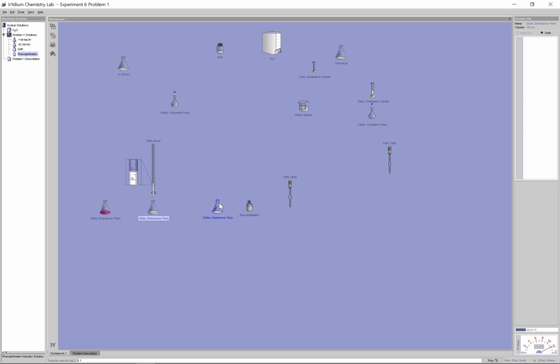I can actually verify, okay, let me make sure that I put phenolphthalein in there, just to add a couple, oh, so there you go. So that's just actually, okay, my mistake here. Maybe I forgot to drop in the phenolphthalein. I actually had overshot the endpoint, but I didn't know that, right? So in that case there, whoops, that's an outlier here. Phew, at least I still have one more trial.